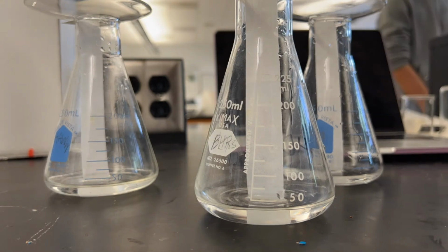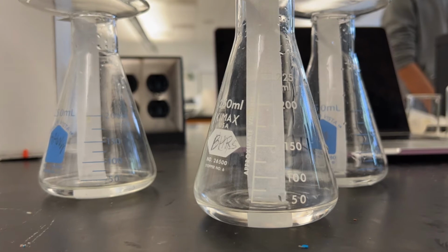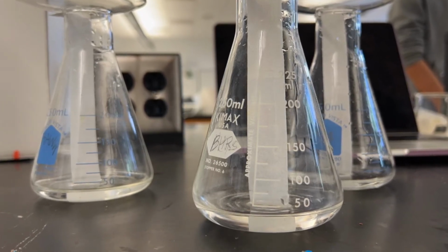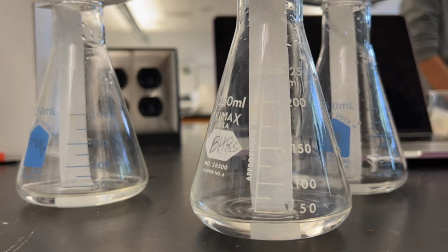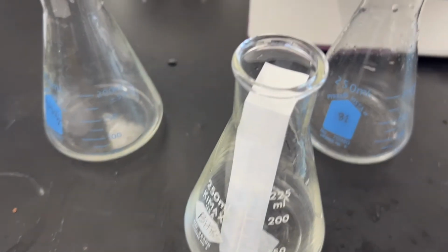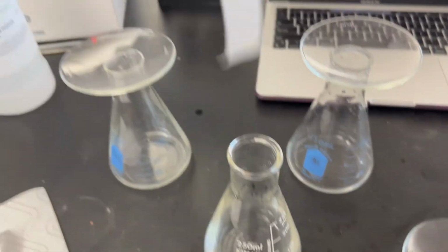Use a graduated cylinder to measure 20 milliliters of your chosen eluent solution and pour into a 250 milliliter Erlenmeyer flask. Repeat this process for 2 more flasks before placing your chromatogram strips inside and hanging the lip over the edge of the flask. A watch glass should be placed over the edge of the flask with eluent inside to prevent it from evaporating. Allow the strips to develop for 20 to 30 minutes before carefully removing them and placing them on a towel. Try to avoid dropping the strip into the solvent.